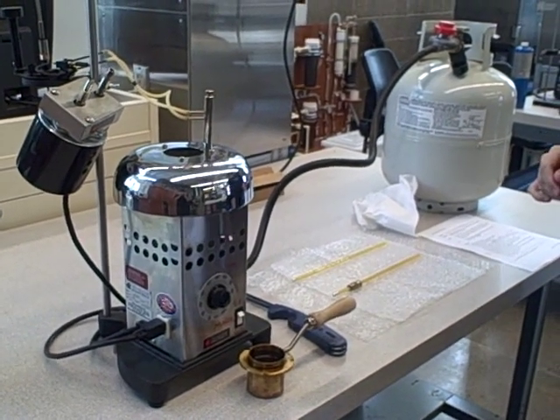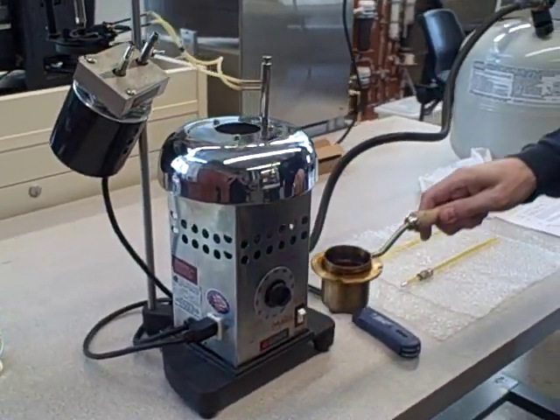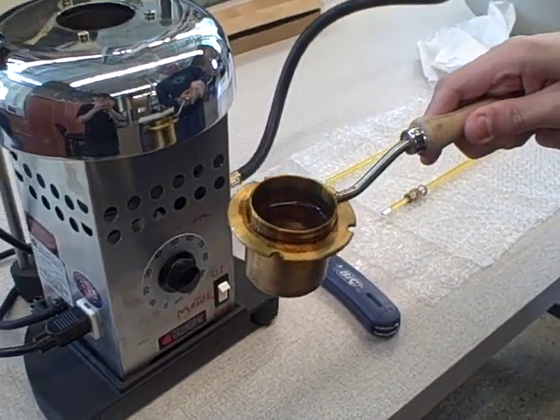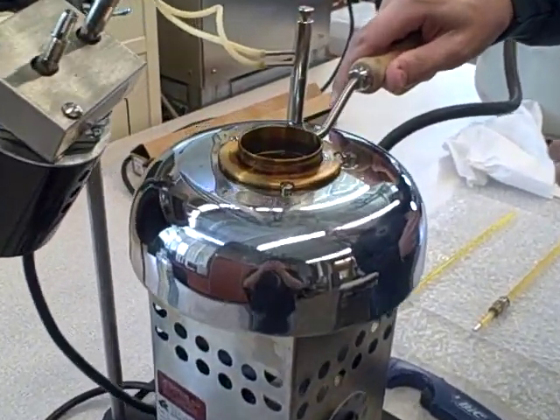I'm going to go through the procedure of the Pensky-Martens Flashpoint Tester. After you've made sure the cup is clean and dry, you fill it with oil up to the mark, which I have in there. And then you place it onto the stove, and it'll fit in with the screws there.